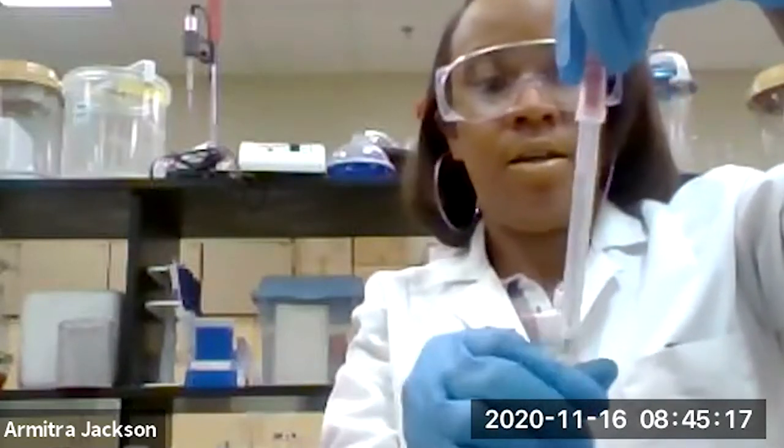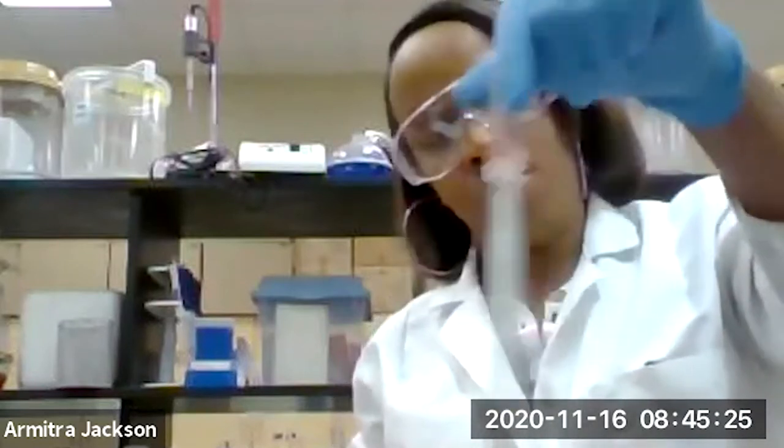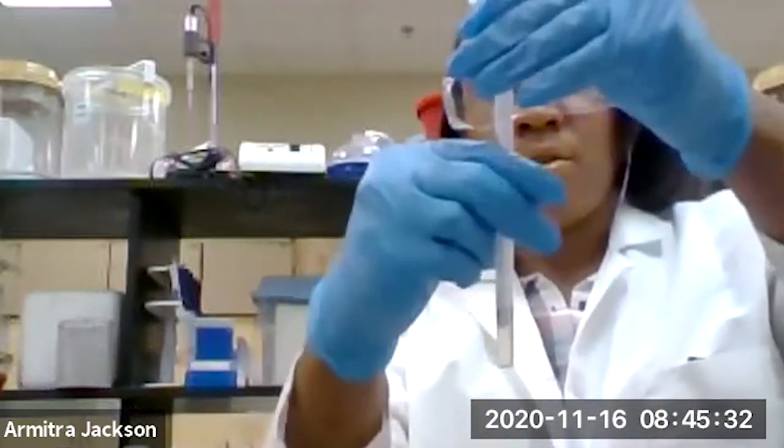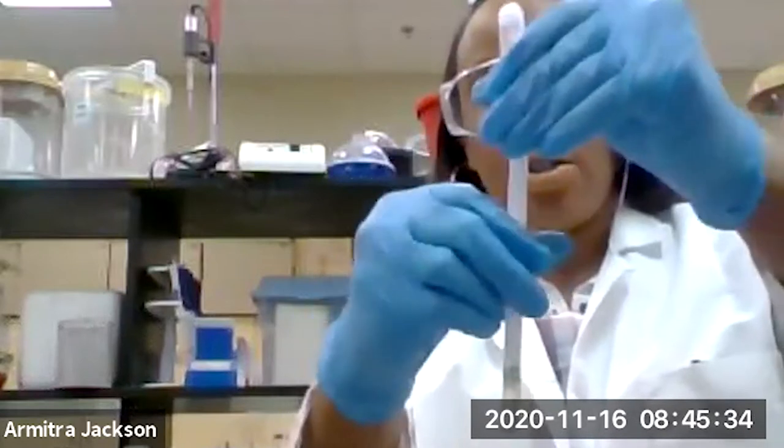We're just going to give it a good shake to get those cells off of the swab, and then into our microbiological media. Now what we're going to do is take our swab.